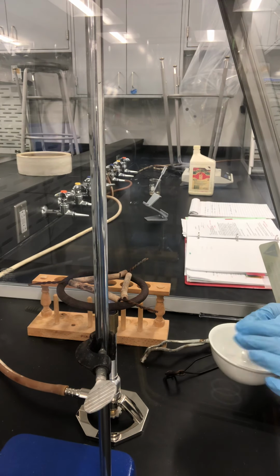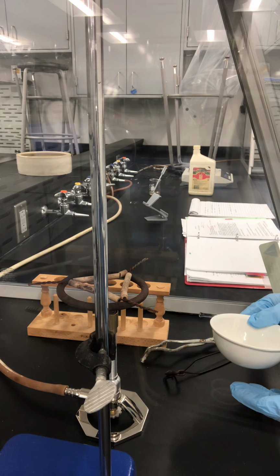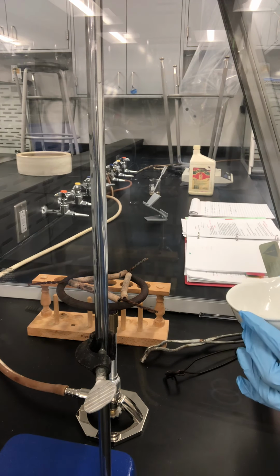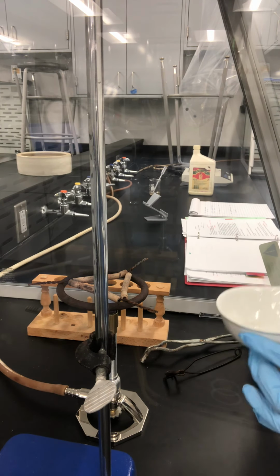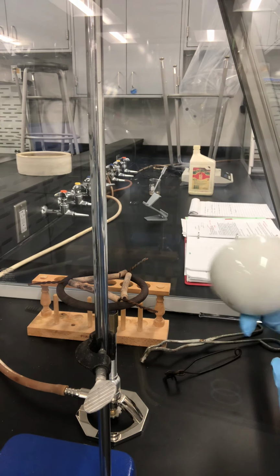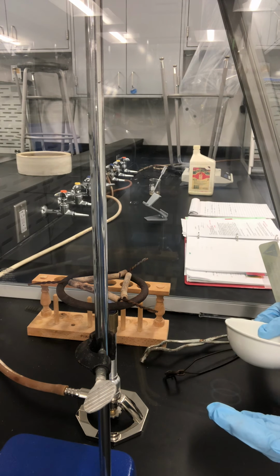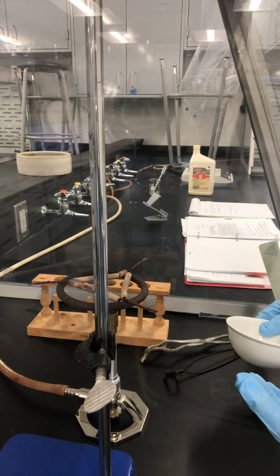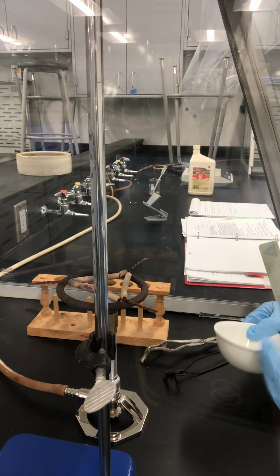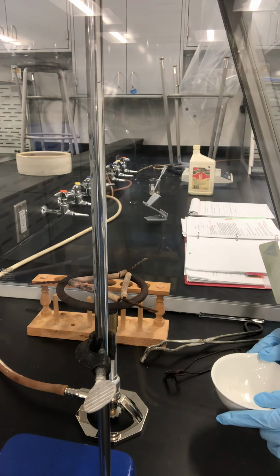Step 4, I need to measure the weight of this evaporating dish by itself, because later I'm gonna add the lubricant oil, burn off the lubricant oil, and leave the ash in the evaporating dish. Then I will measure the weight of the evaporating dish again. By subtracting the evaporating dish weight, I will know how many grams of ash, and that will be our ash content.